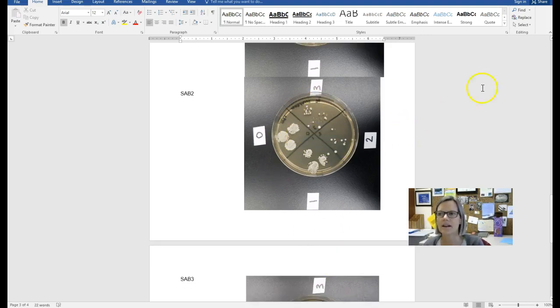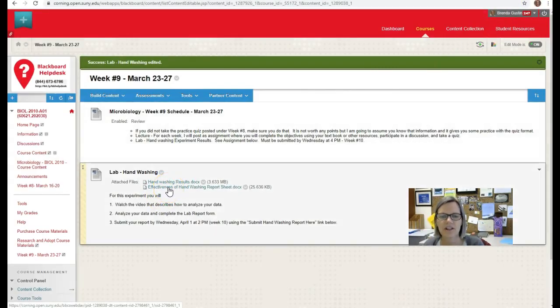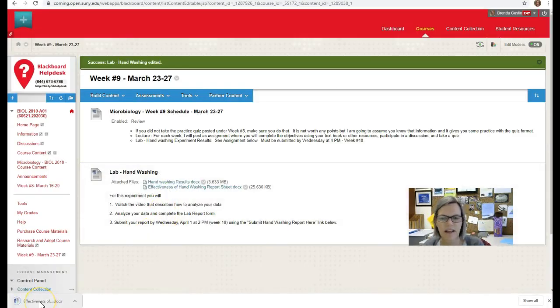Okay, so now I'm going to click out of here, and I'm going to go to your hand washing sheet. This is your report sheet. This is similar to the report sheet that you have as a hard copy already.